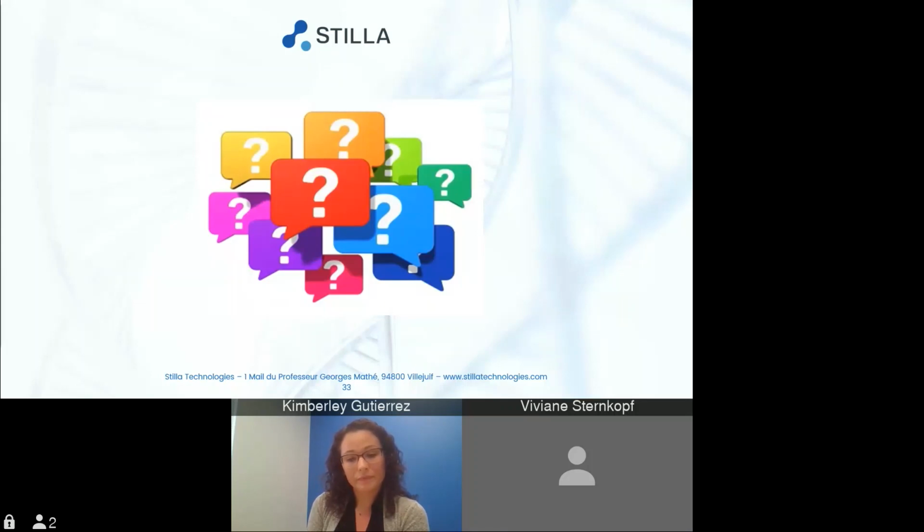One question would be, do I have to decide on the 3 or the 6 color system? So do you have both available? Currently, right now, the 3-color system is what's commercially available. We are taking orders for the 6-color system, but it should be delivered by the end of the year. Okay, thank you very much.